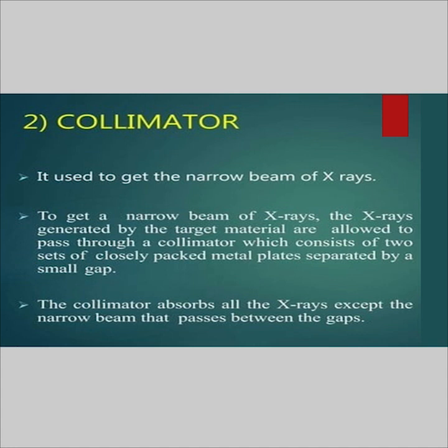Within each atom, the place of the ejected electron is promptly filled by an electron from an outer shell, whose place in turn is taken by an electron coming from still further out. Thus, the ionized atom returns to its original state in a series of steps, in each of which an X-ray photon of definite energy is emitted, or excess energy is released by ejection of a second electron with characteristic energy.